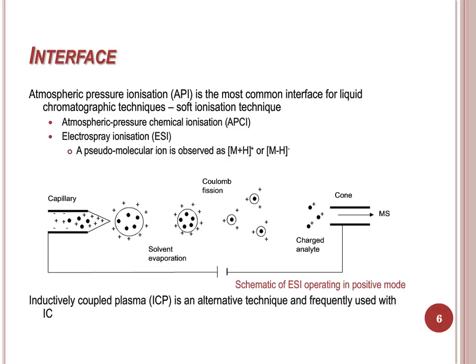The majority of the methods covered today use electrospray ionization, shown here. This mode of ionization is a soft ionization technique, as the energy transferred is often too small to allow fragmentation to occur, meaning a pseudo-molecular ion is observed.